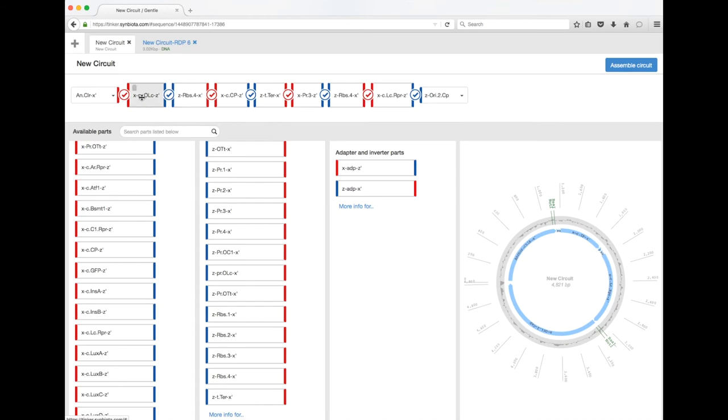Let's go through this circuit. We've got a promoter with an operator site for LacI. LacI is a protein that, if present in the cell, will bind here and prevent the promoter from working — it'll prevent the RNA polymerase from initiating and transcribing. Under that promoter we're controlling the expression of blue chromoprotein, with an RBS enabling translation of blue chromoprotein, and a terminator to insulate the program. Next we've got another circuit with a promoter of pretty high strength and a high-strength RBS.